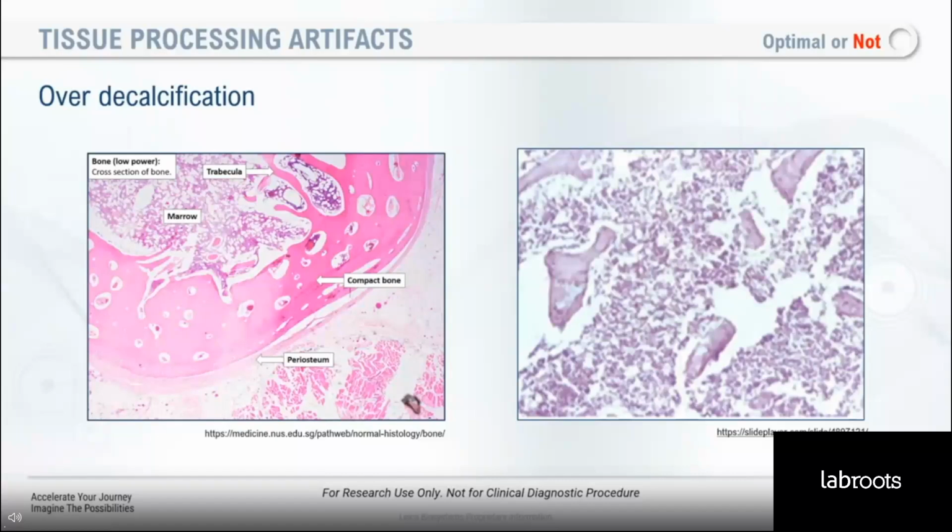Be aware that decalcification solutions, whether they're purchased or they're formulated in the lab, are harsh, usually acidic. So monitoring the process of the time needed to get to the endpoint where you can get a section is necessary, but being mindful of that time is important so that you not only have good histology when it comes to H&E, but that your IHC results are good too.